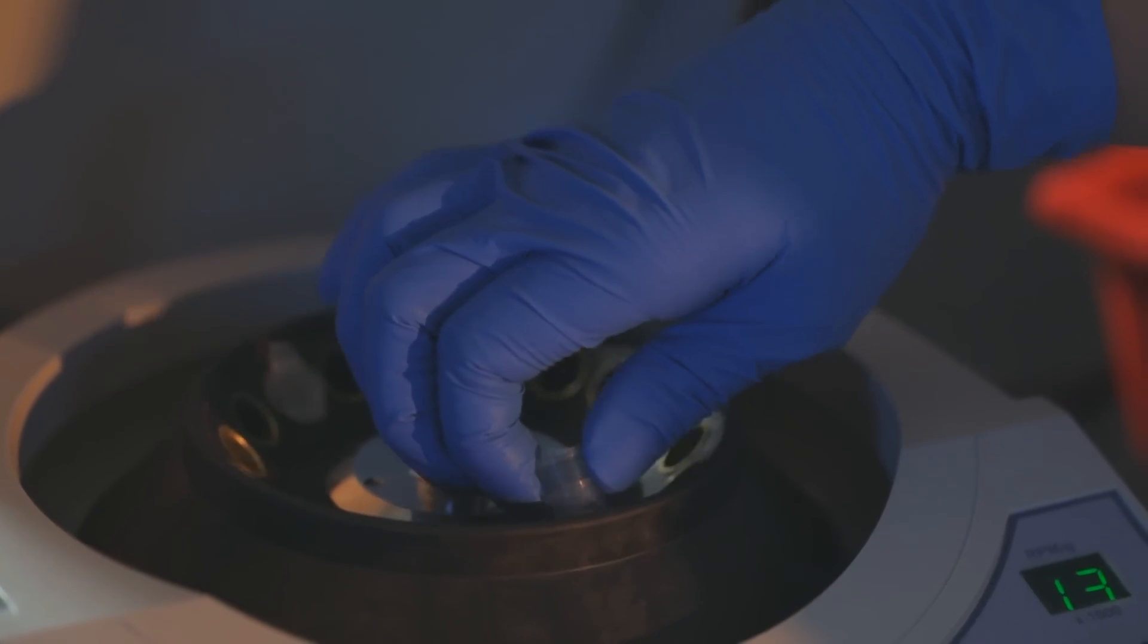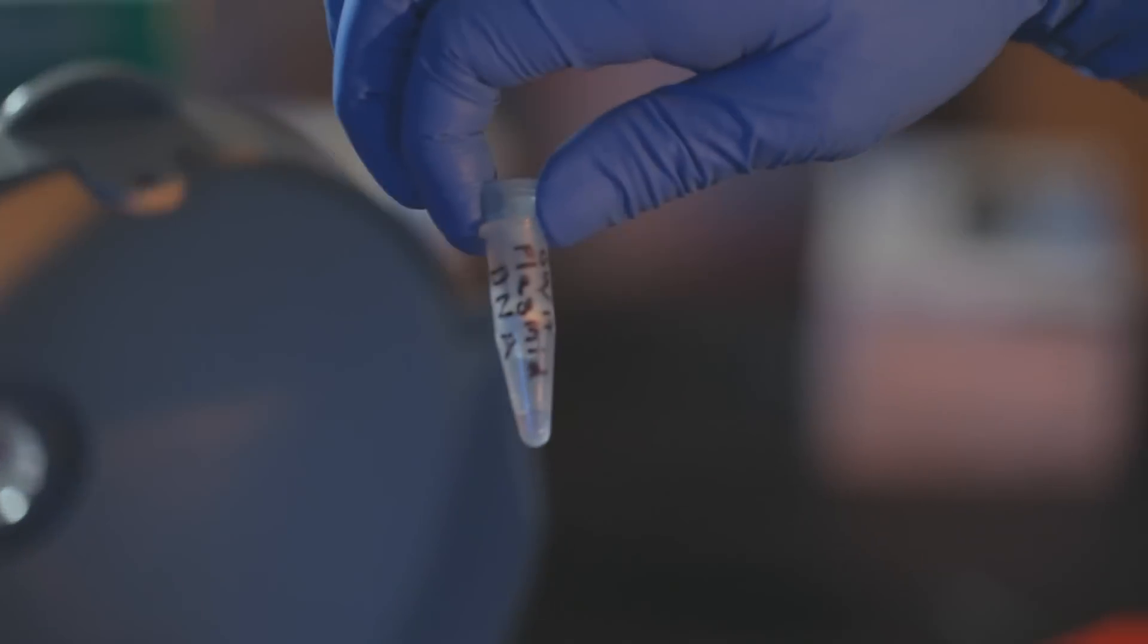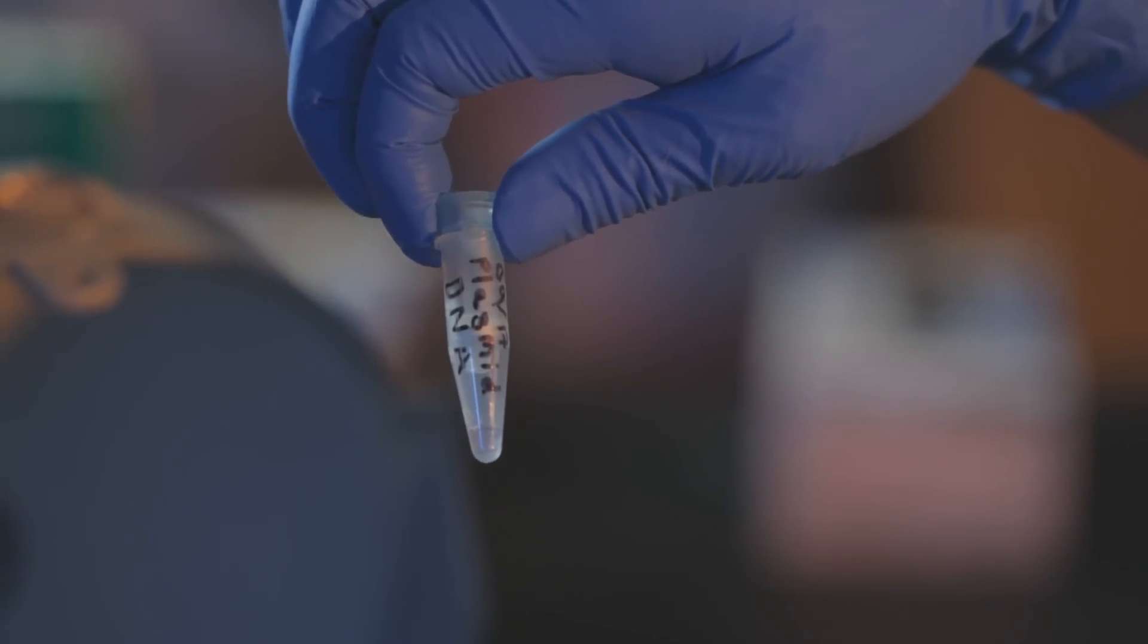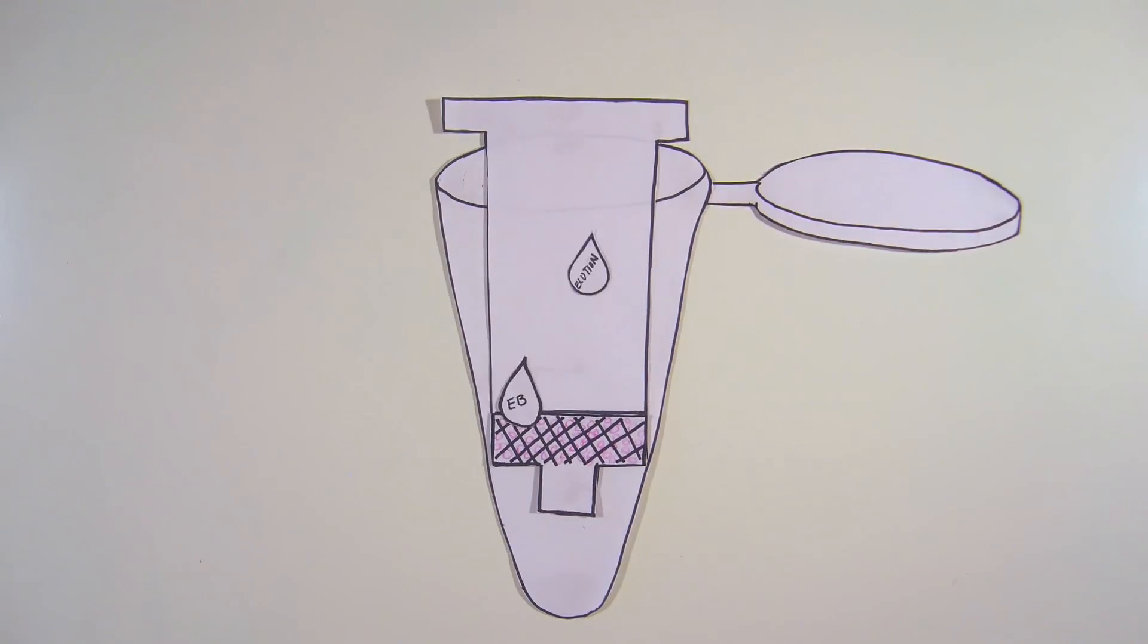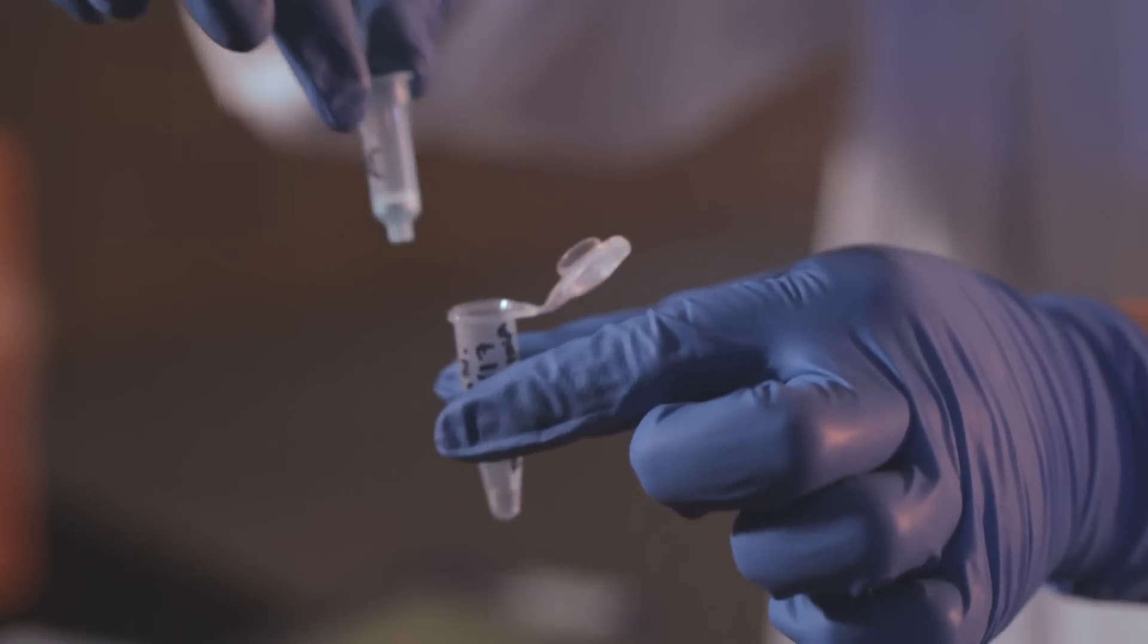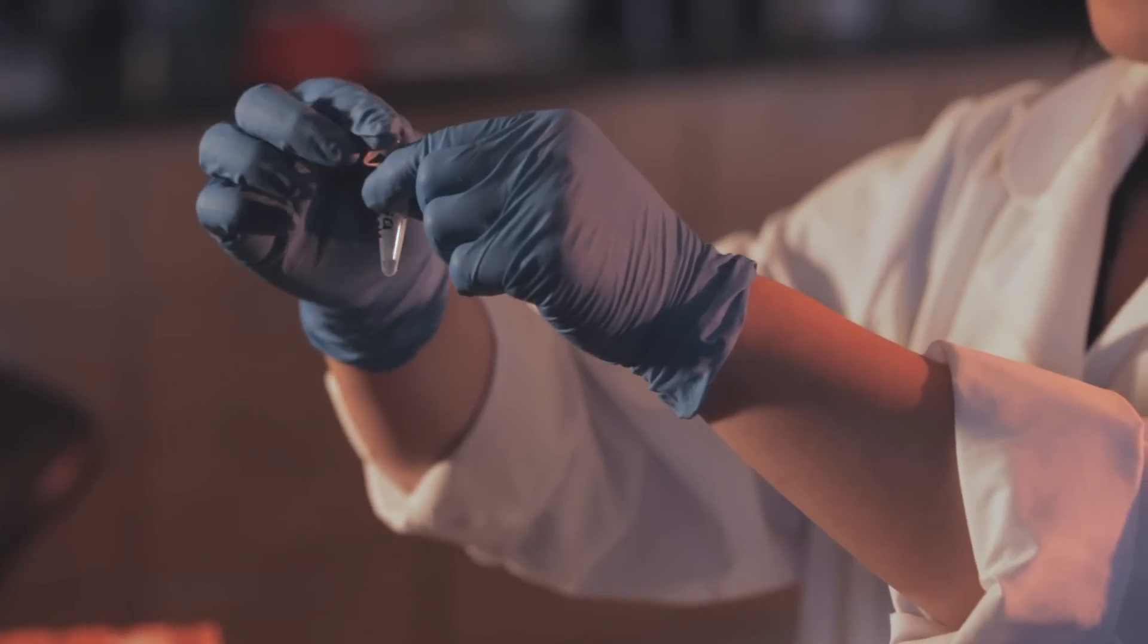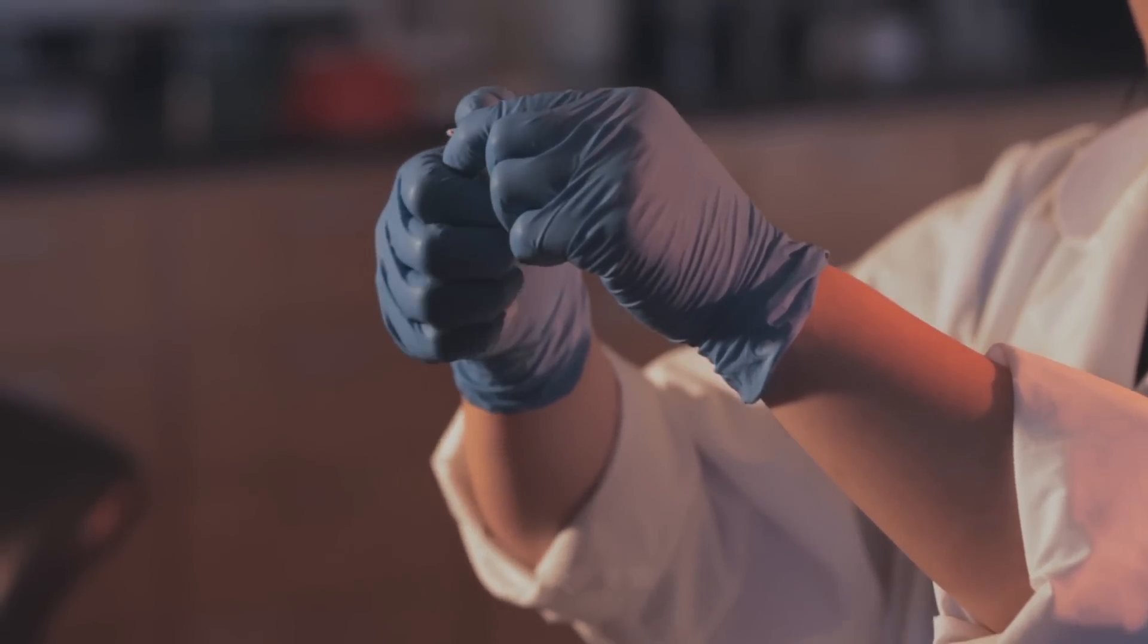After centrifugation, you should see about 50 microliters of clear, colorless liquid in the bottom of your microcentrifuge tube. This contains purified plasmid DNA. Discard the spin column, but keep and store your tube of purified plasmid DNA.